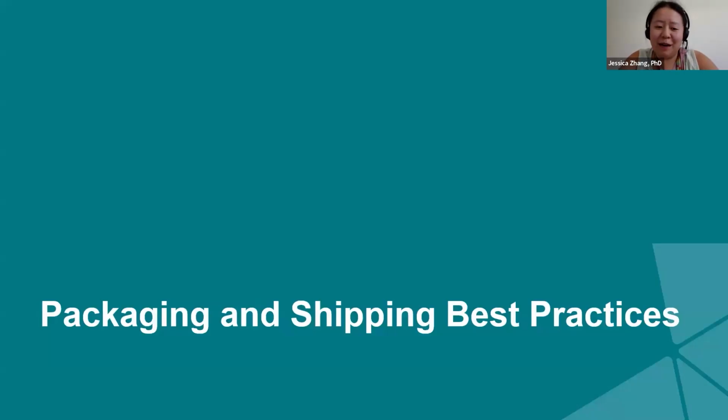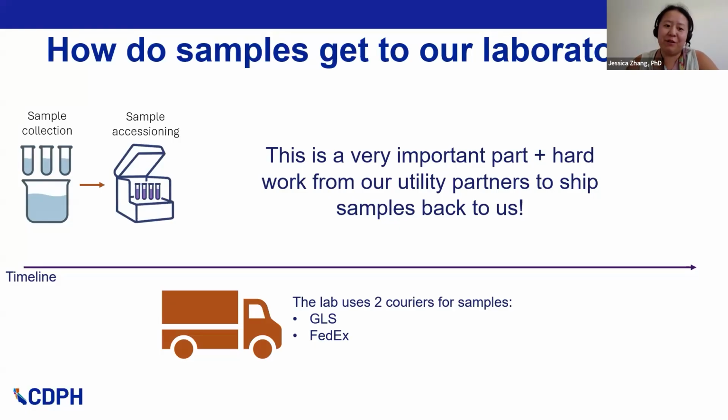I'm Jessica, and I'll be taking over to discuss some best practices that we recommend for packaging and shipping of samples. How do samples get to our laboratory? There's a sample collection step, and then ultimately once we receive the samples in the lab, as mentioned before, we'll accession the samples and give them each a unique ID.